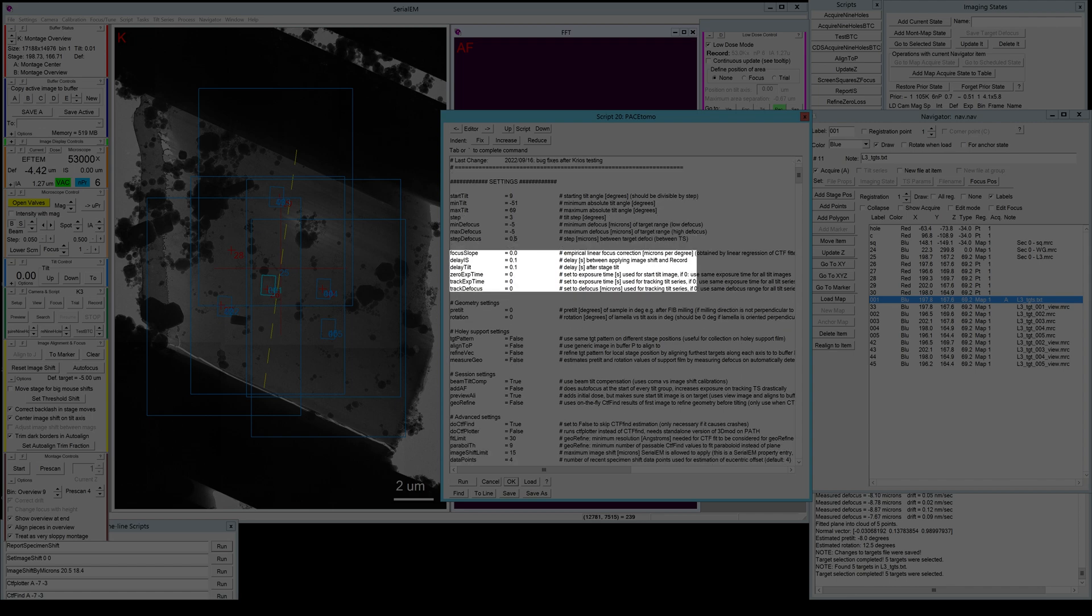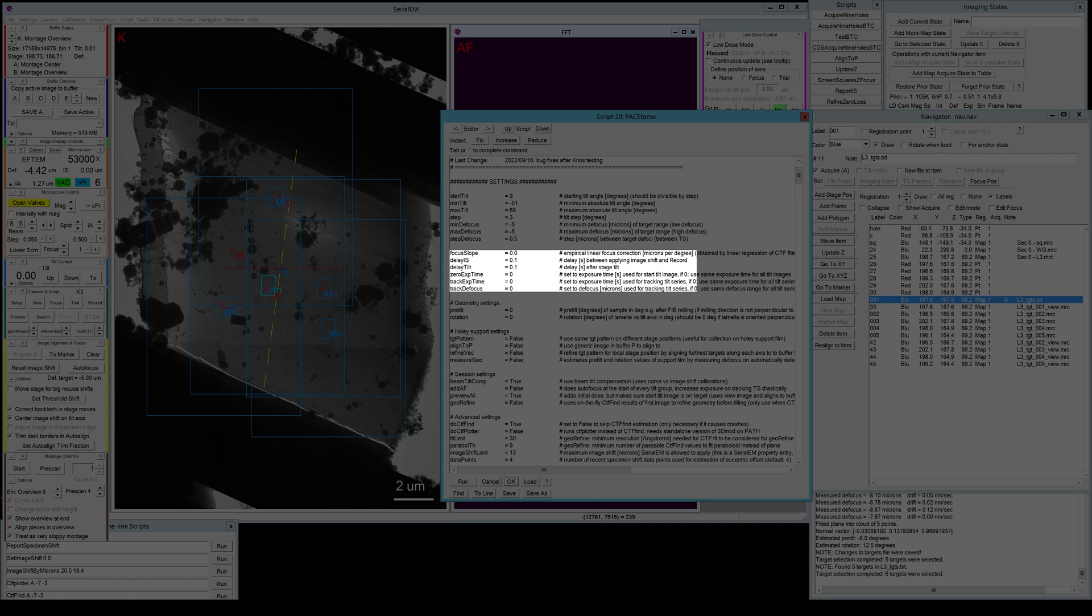The focus slope is something I don't really use anymore. This is in case your tilt axis offset is not perfectly defined and you still end up with a slope of the defocus versus your tilt angle. And if you know the slope and you saw it's quite reproducible between your tilt series, you can actually compensate for that by applying a fixed defocus slope for every one of your tilt series. But if your tilt axis offset is determined quite well, this is usually not necessary.